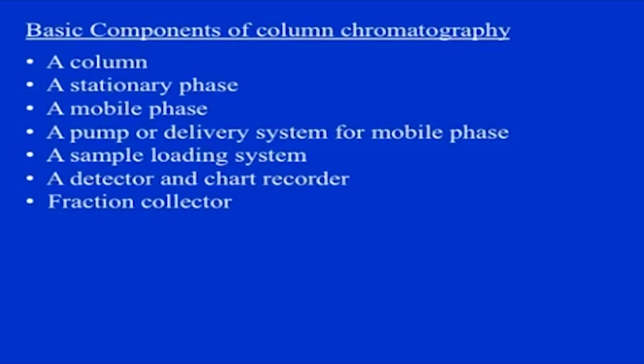In previous lectures we have dealt with the basics in chromatography, that is, we have discussed the basic concepts in chromatography, and we have also discussed the various performance parameters of chromatography. Now, in this lecture we are going to extend our discussion on column chromatography, the most widely used chromatographic method. What are the basic components of column chromatography?